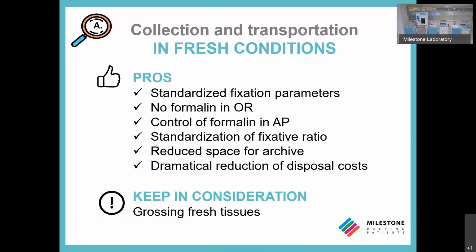Then, as mentioned, there is a dramatic reduction in disposal cost due to the reduction in space and dumping material. We need to keep in consideration in this case that the tissue will arrive fresh, and therefore the grossing for a pathologist assistant will be done on fresh tissue.